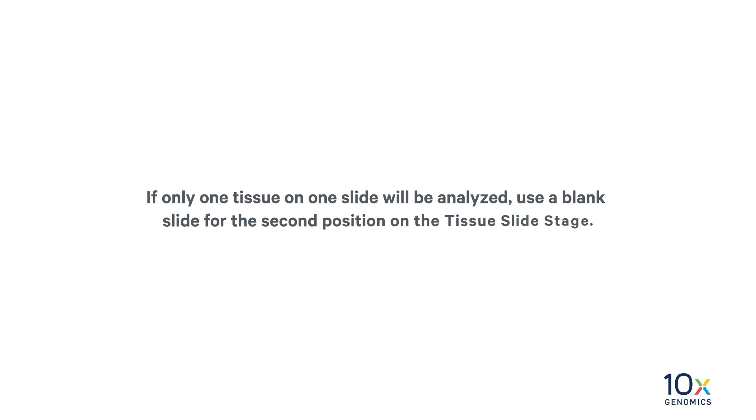If only one tissue on one slide will be analyzed, use a blank slide for the second position on the tissue slide stage. Next, we will load the Visium slide assist spatial gene expression slide.